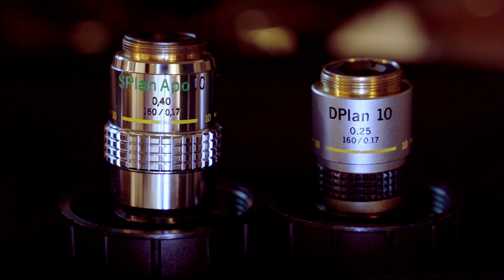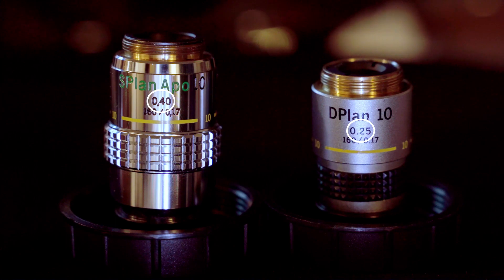Numerical aperture is so important for microscopy, they print it right on the lens. Don't ignore numerical aperture if you're shopping for a new lens.